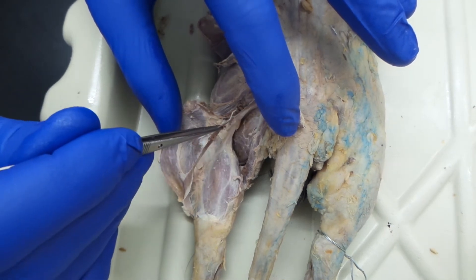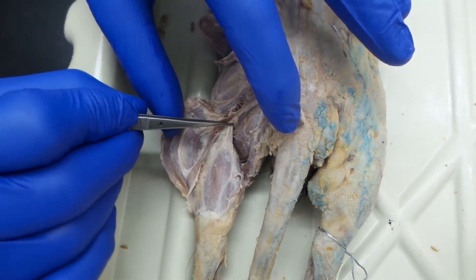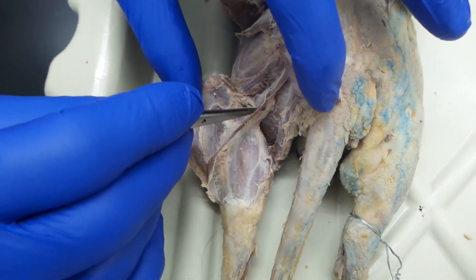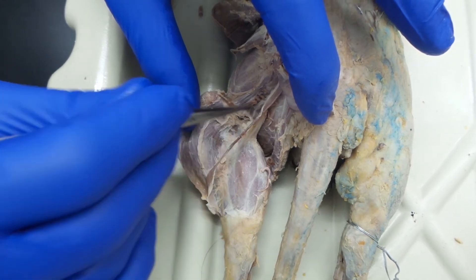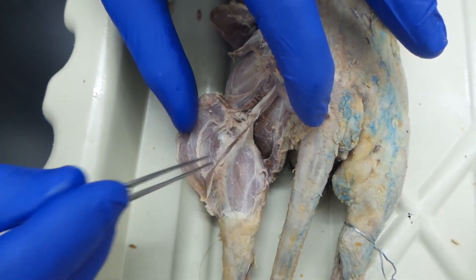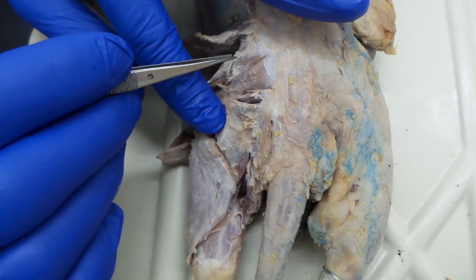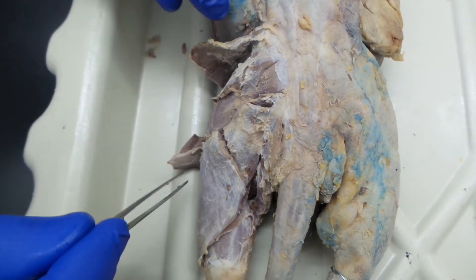Looking deep, you have the tenuissimus holding open the biceps femoris — that's the sciatic nerve. That's semitendinosus, semimembranosus. And if you kind of pull things to the side, we're looking at the semimembranosus here. This is adductor femoris once again. So: adductor femoris, semimembranosus, semitendinosus, tenuissimus, biceps femoris, caudofemoralis, gluteus medius, gluteus maximus, tensor fasciolati, vastus lateralis, sartorius.